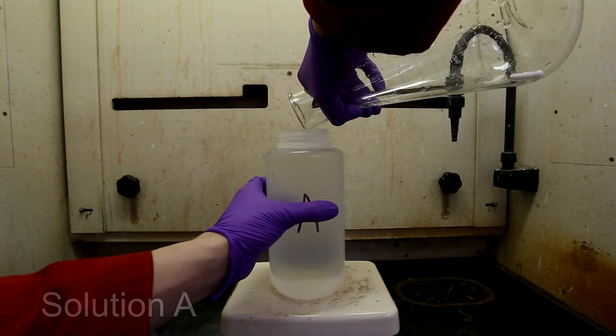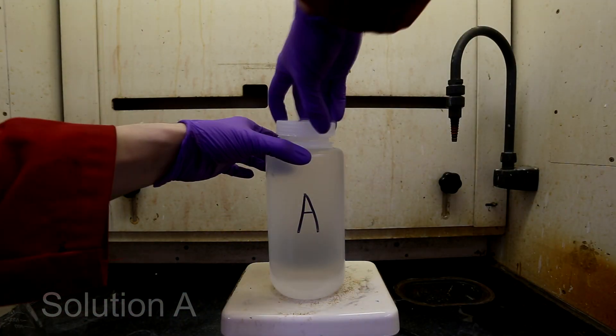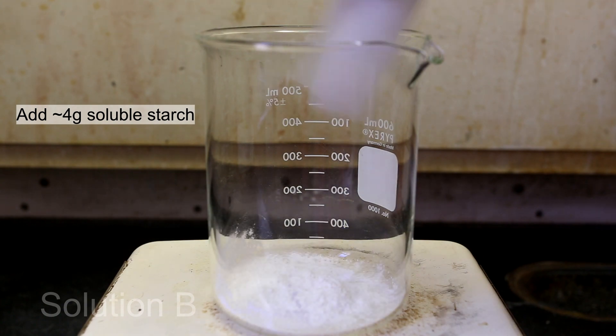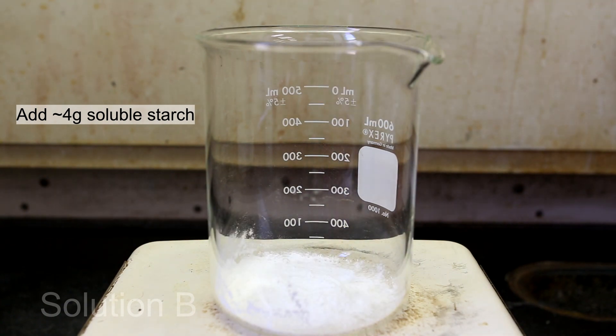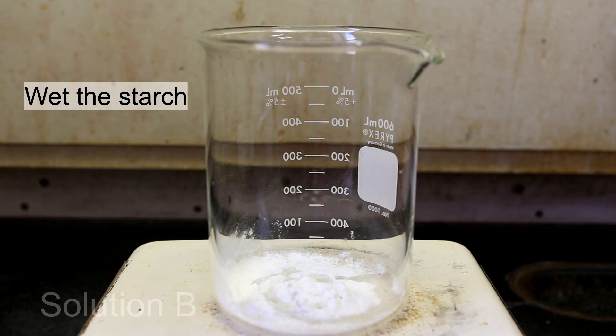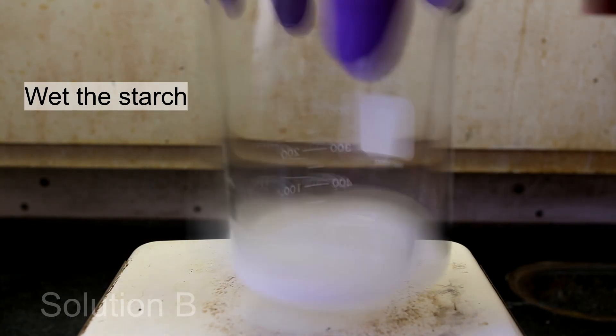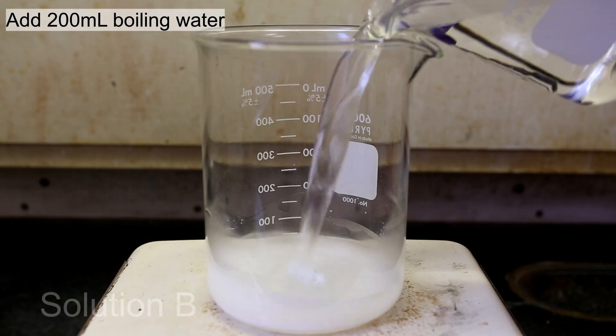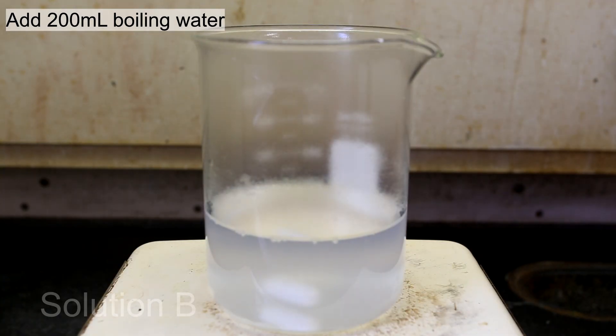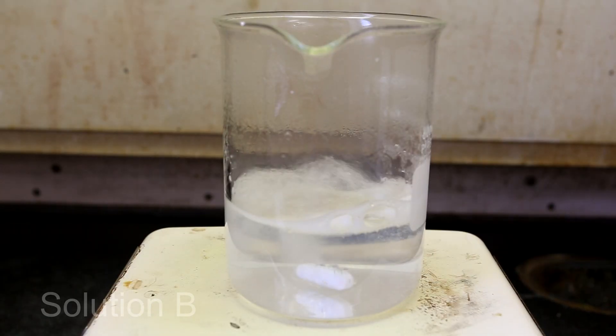We will put solution A aside for now and move on to making solution B. First, add 4 grams of soluble starch to a beaker. Next, add a small amount of water to the beaker and swirl the water around to wet all of the starch. Next, add about 200 milliliters of boiling hot water. After boiling the starch solution for a few minutes, it should start to clear up.